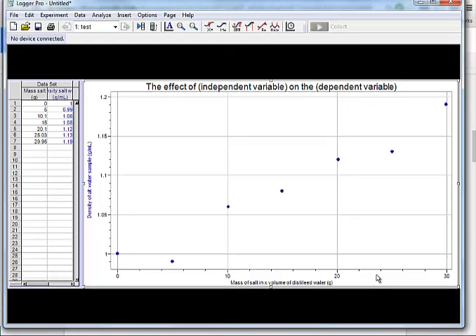One more thing, other than what we talked about before you went into the lab, you need a best fit line or best fit curve. Now you should already know what those are, but a best fit line or curve does not connect the dots. It's sort of splitting where the data goes. Now, you're never going to have in a lab a perfect straight line or a perfect curve. It just doesn't happen. Okay? There is one lab where it almost might happen, but really, if you looked at it close enough, it's never perfect. Okay? So, nature doesn't work that way.